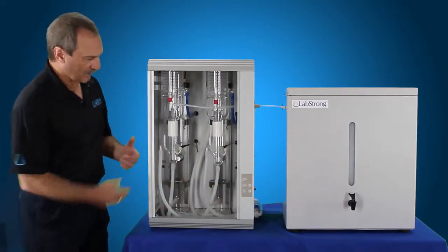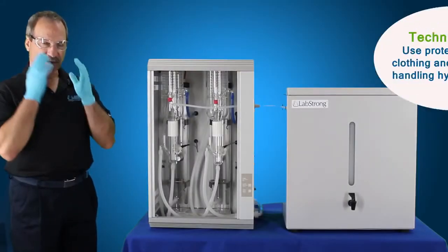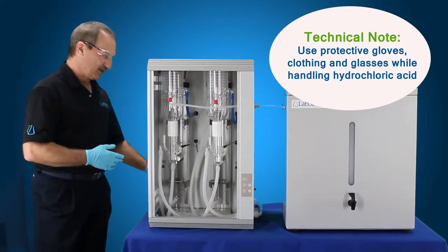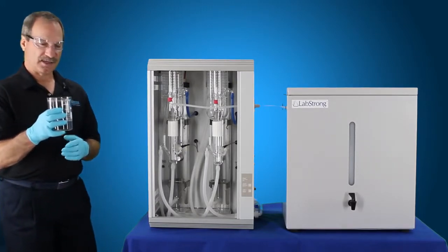So at this point is when you want to go ahead and put in your acid solution. We're going to put our gloves on, our safety glasses, and any protection equipment you're going to need to handle your cleaning solution, which is 100 ml of water and 100 ml of hydrochloric acid.